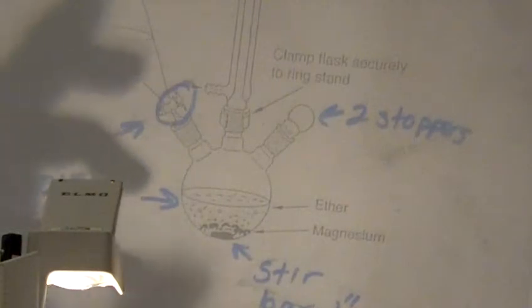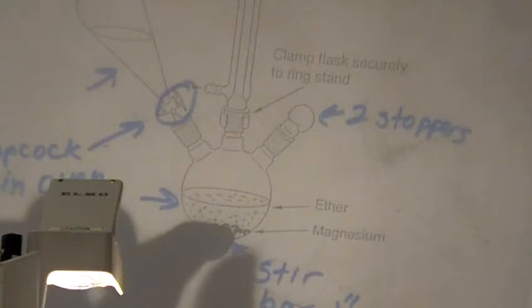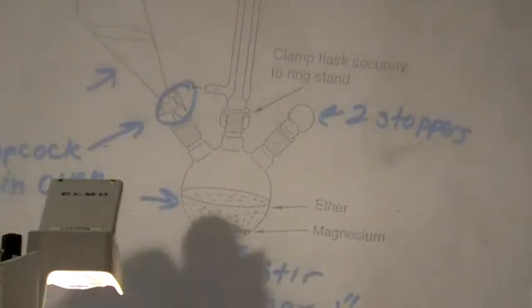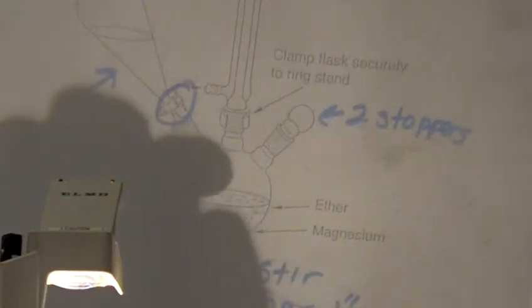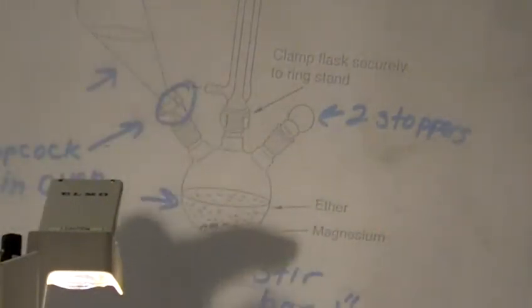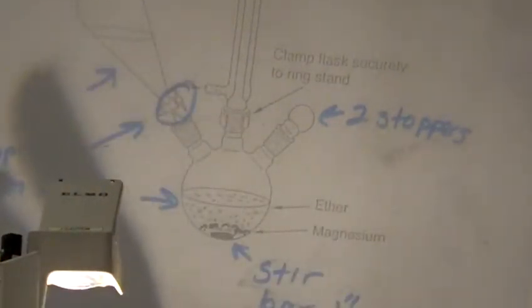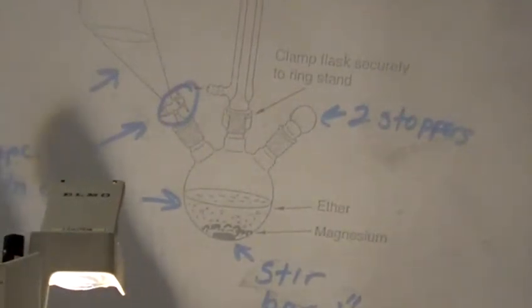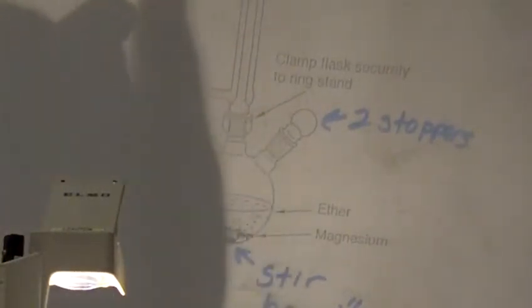And then what we need to do is get the reaction going, all right? So you need to start seeing signs of it reacting. It'll start turning cloudy down here. The color of the iodine will dissipate. You'll start seeing bubbling on the magnesium. All of those are signs of reaction. And to help spur that on, you're going to actually warm this apparatus with your hands, okay? Because ether doesn't have that high a boiling point, and it doesn't need that much heat to get the reaction going, okay? So you're going to warm this guy with your hands, watch for signs of the reaction, and then you're going to start adding this solution dropwise, okay?